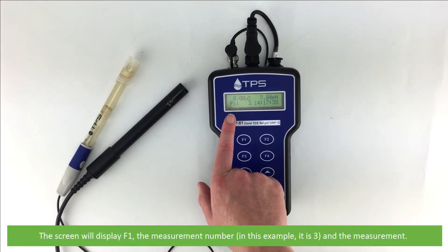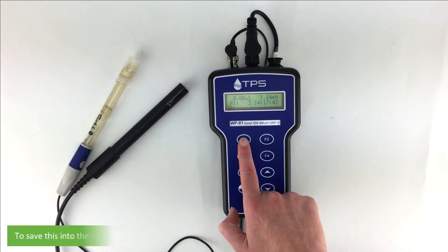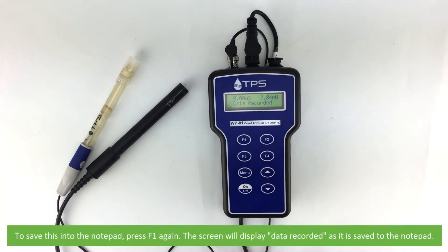The screen will display F1, the measurement number — in this example it's 3 — and the measurement. To save this to the notepad, press F1 again. The screen will display data recorded as it is saved to the notepad.